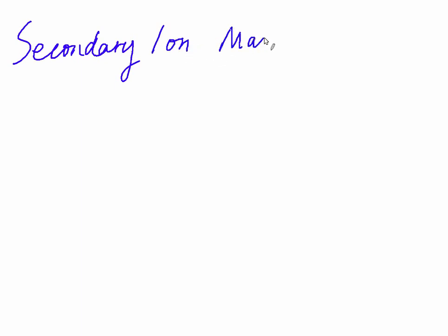In this lecture, we are going to talk about secondary ion mass spectroscopy, in short, SIMS.